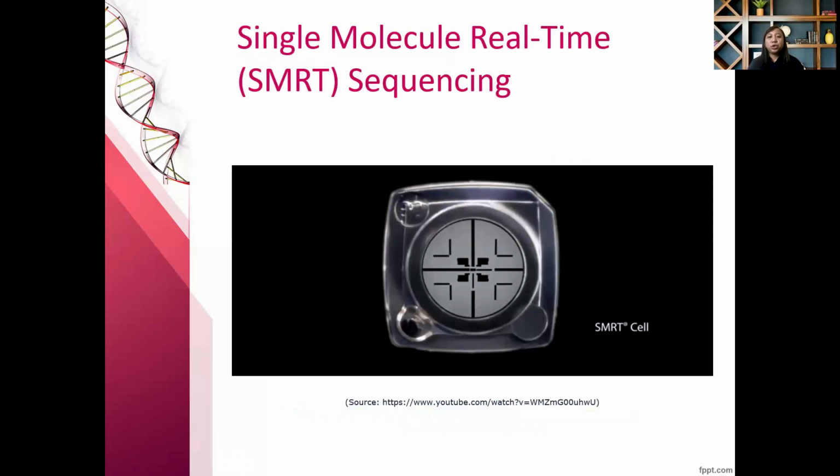This video shows single molecule real-time sequencing with a zero-mode waveguide.